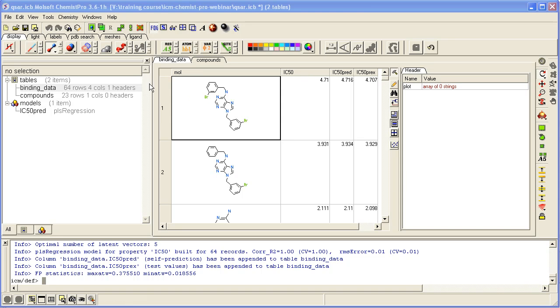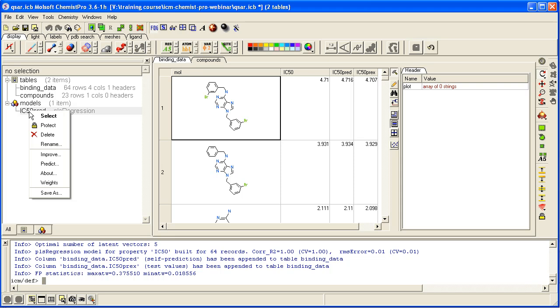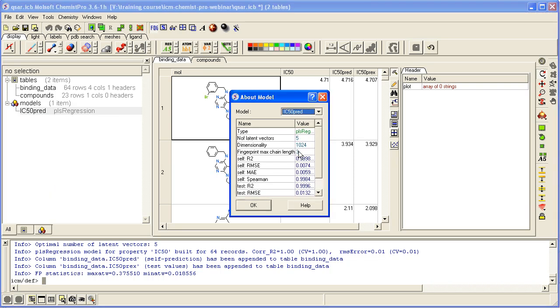So here we have the model already made. You can view it by clicking about, and that will tell you how good the model is.